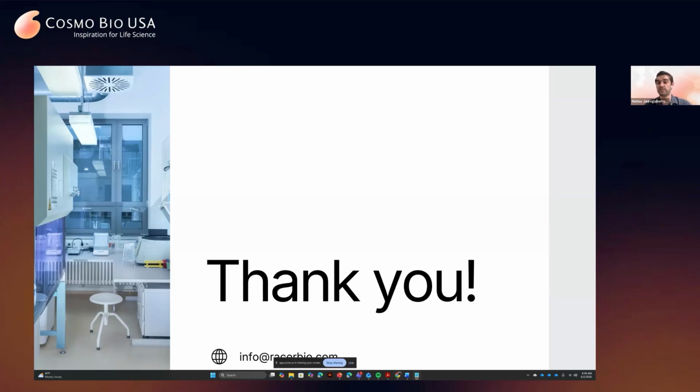We do have our first question: do you plan to offer a web tool to assess full-length sequences for the best sites to split into fragments, maybe also taking into account the customer's desired max fragment length? Yes, absolutely. That's something we currently have in process that we're really excited about. We're hoping to have a beta launch of that software available in the coming months. So stay tuned. You can get in touch with us and we can let you know when that launches.